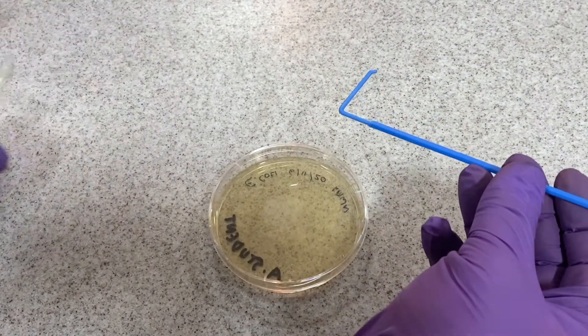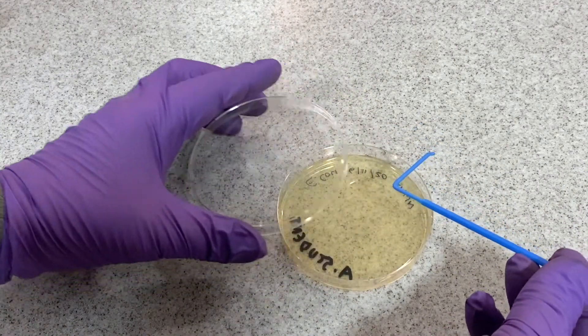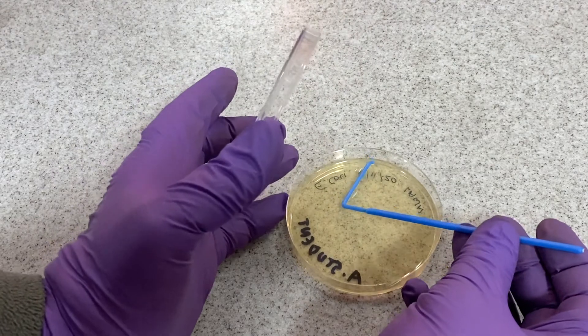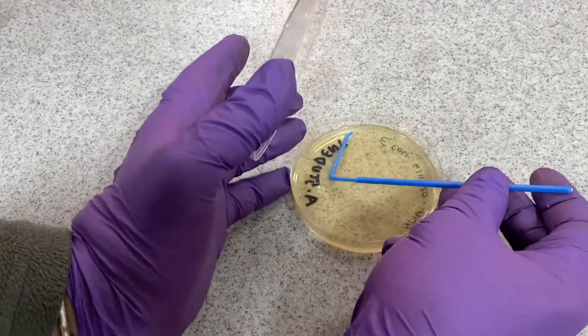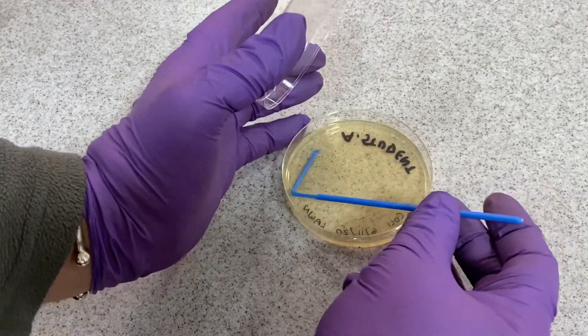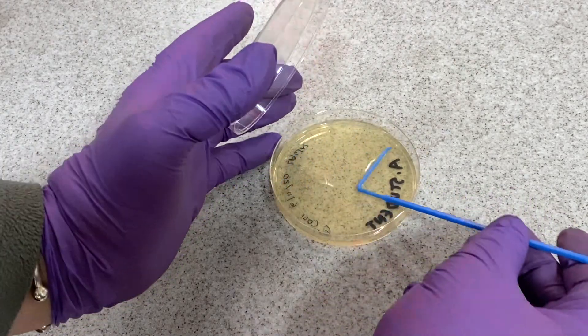Either a disposable spreader like this one in the example or a glass spreader. The technique for this is to use the spreader in one direction and rotate the plate anti-clockwise, so that the spread of the bacteria is completely to the edges of the plate.